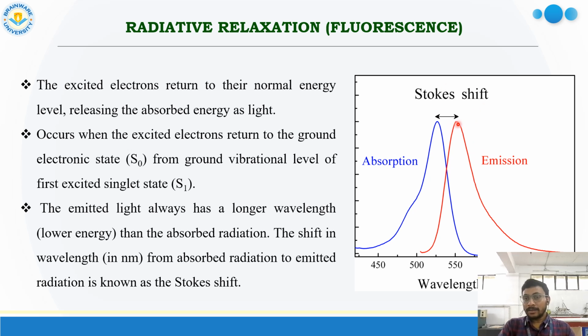Higher energy has lower wavelength, lower energy has higher wavelength, so from lower wavelength to higher wavelength there is a shift, and this shift is called Stokes shift.